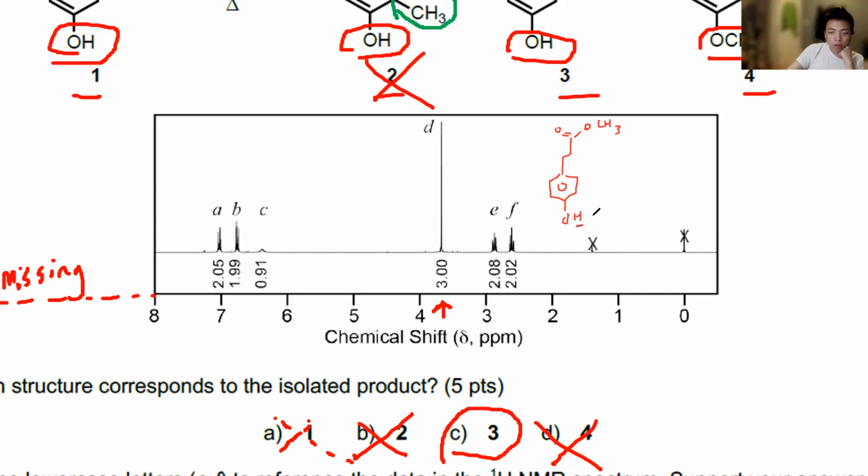This is exchangeable, so it's not on the spectrum. Or maybe because it's on the benzene, it somehow appeared.